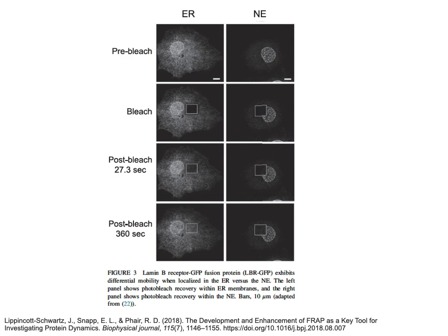Okay. So hopefully you have found this Tech Talk interesting. You've learned about FRAP, you've learned about fluorescent dyes, and how this technique can be used to look at protein dynamics in membranes. But I would also point out, we can also look at these protein dynamics within the space of the cell, so within those lumens, and also in the cytosol.